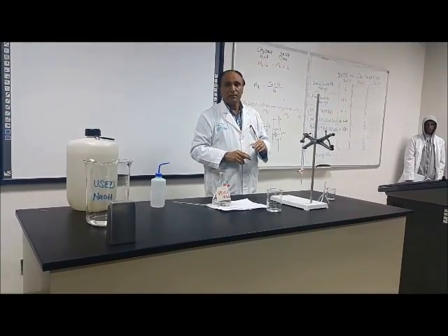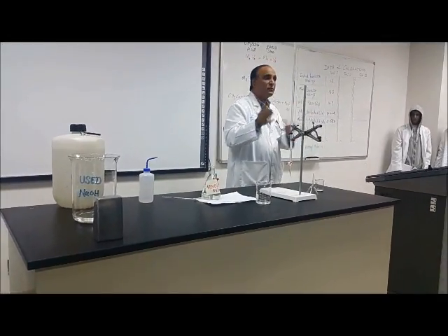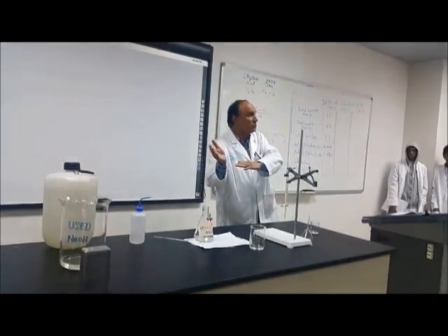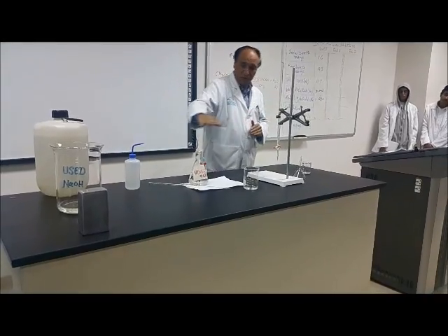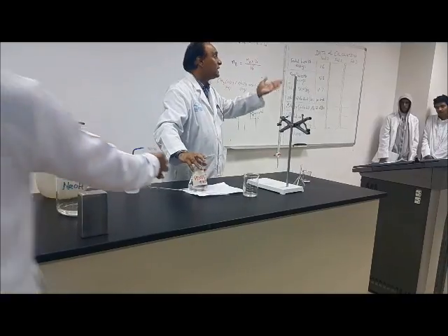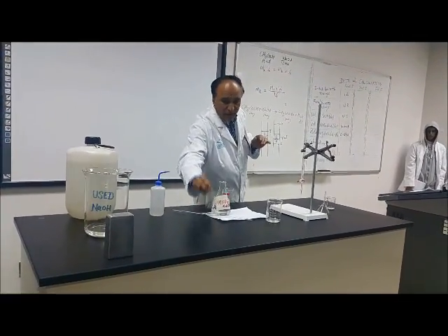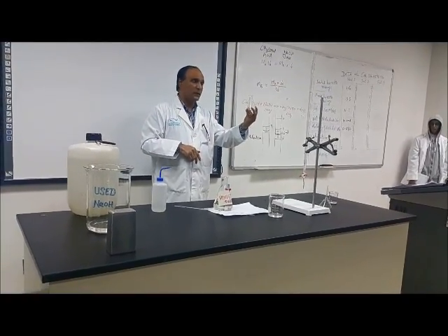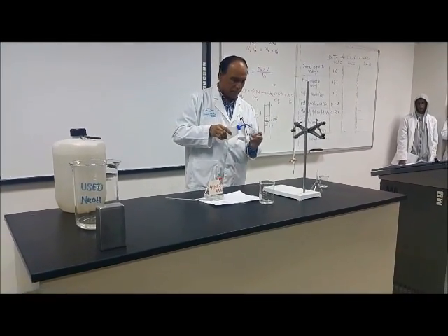I want to tell you that when you repeat the experiment, of course you have to, then the other student should change your work. Now the second student should come here to take the acetic acid. Okay? So he should also get an experience. Did you understand what I said? Yes. Okay, now look, you tell me what to do. This is now washed with the tap water. What do I do? Wash it with the water. Wash first.